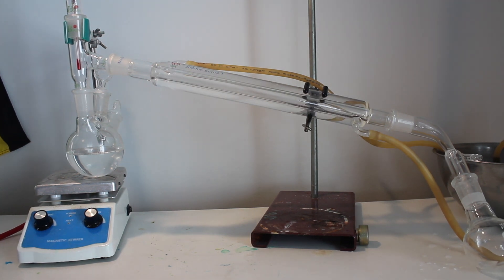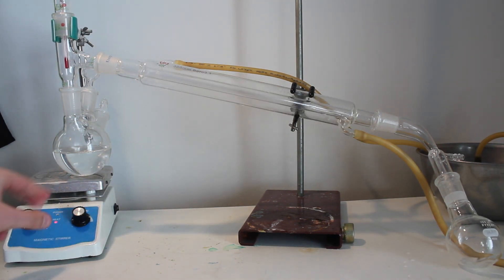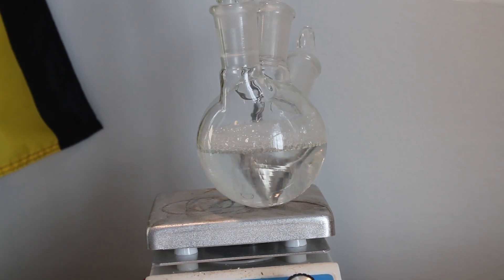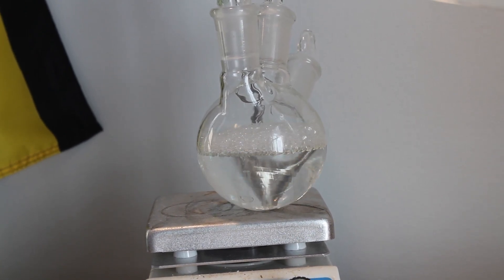This will be added to a round bottom flask, then distilled. There was bubbling, but this was not a problem. If the bubbles reach too high, just turn down the temperature until they recede.